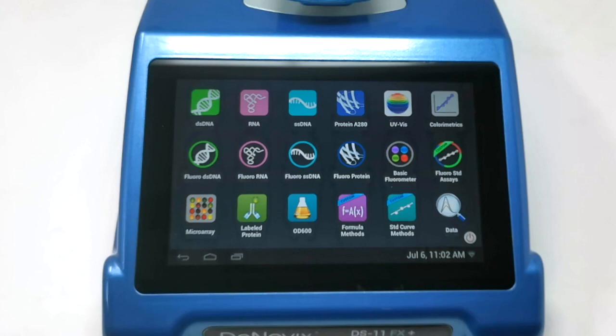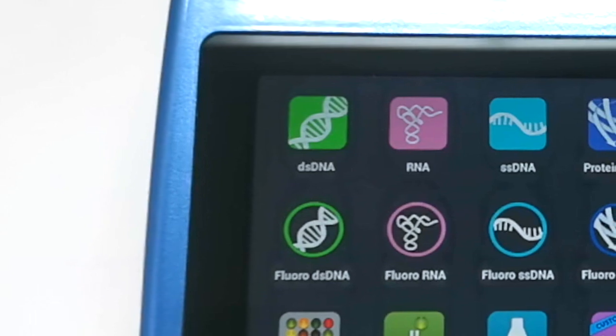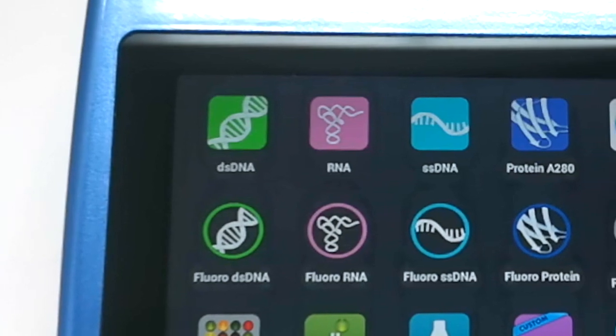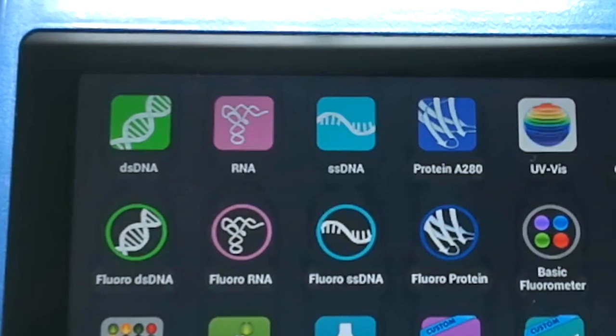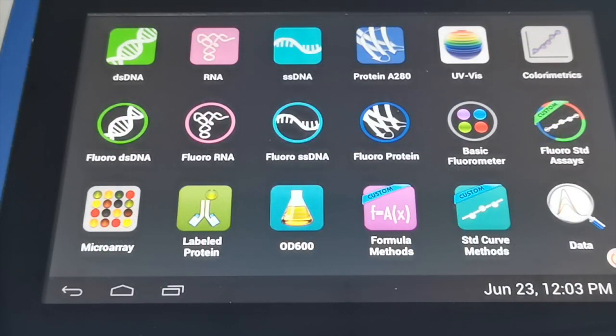On the touchscreen at the front we can see all of the measurement apps broken down into different applications. The reason for this is to avoid any potential mistakes — we have different colour coding for different types of analytes so it's very clear which app is used for DNA, RNA, single-stranded DNA, or protein. For this demonstration we're going to concentrate first on double-stranded DNA and then look at some of the other measurement apps.